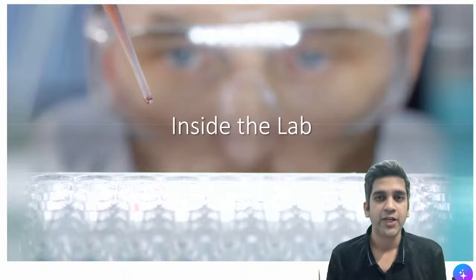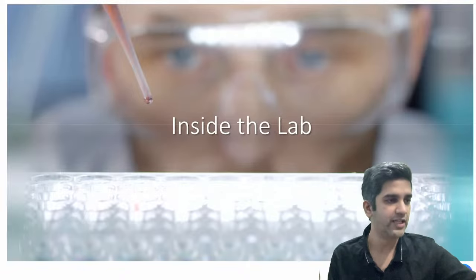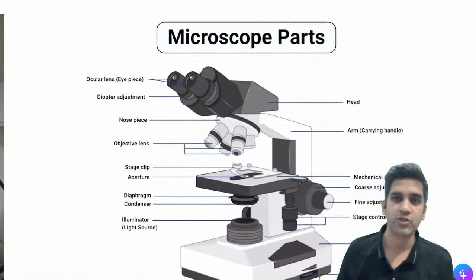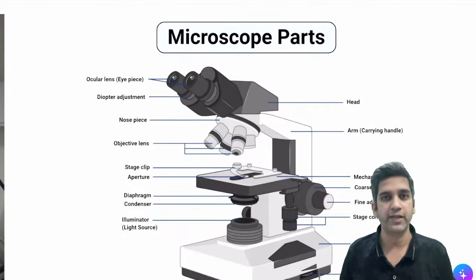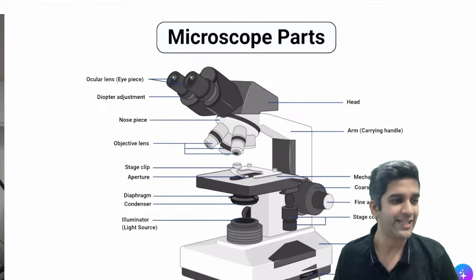Sorry for that. So we're going to continue the same thing we saw in the lab instrument series. Yesterday, in the last class, we saw light microscopy. We had this primary image, and based on that, we built concepts on the use case of everything, in case it's asked in a viva when you're standing in front of a microscope under the slide, because every examiner knows the slides any which way.